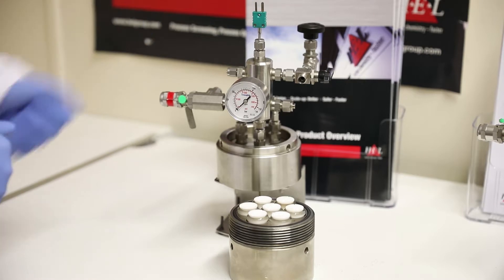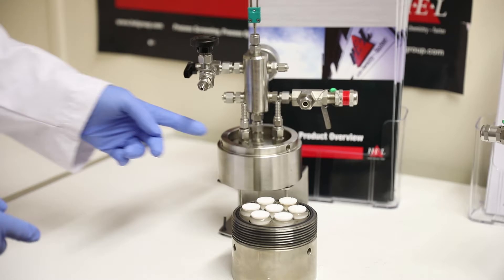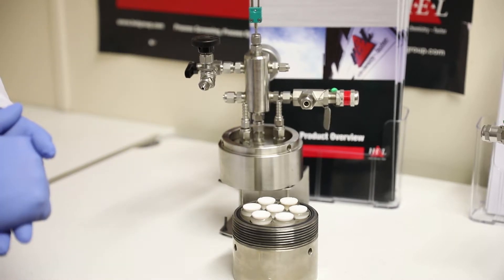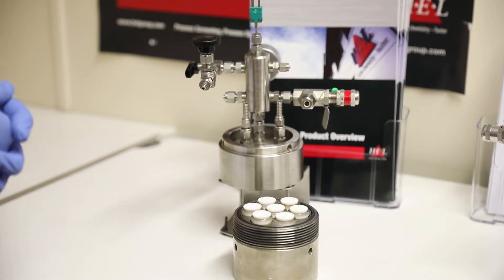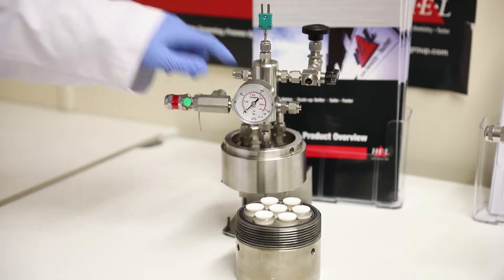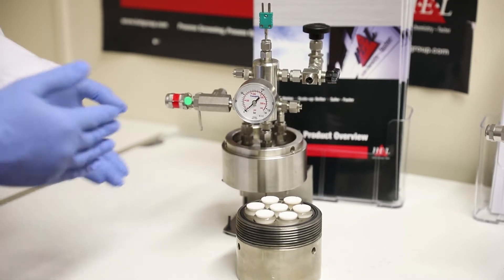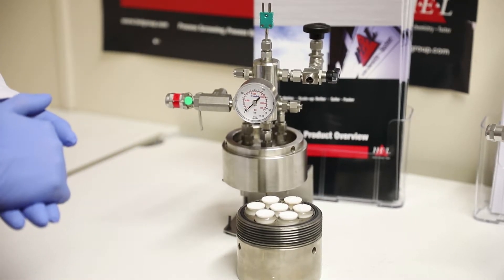We also have a thermocouple. There are two ports on top of the lid for liquid to go in and out, and that's to cool the lid of the reactor so you get a degree of reflux. Because you've got common headspace within all the CAT reactors, they're not suitable for screening different solvents, but they're an ideal tool for screening different catalysts, different ligands, or for small library work.